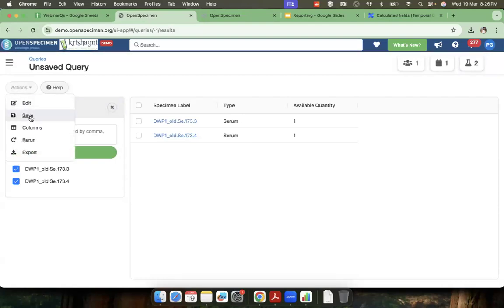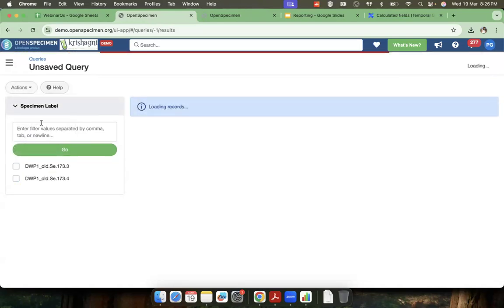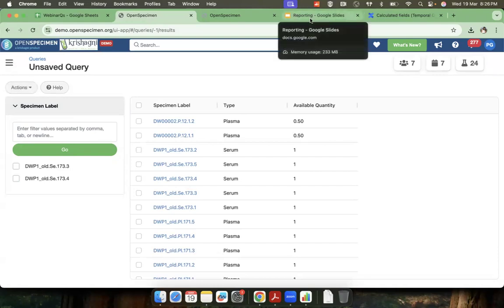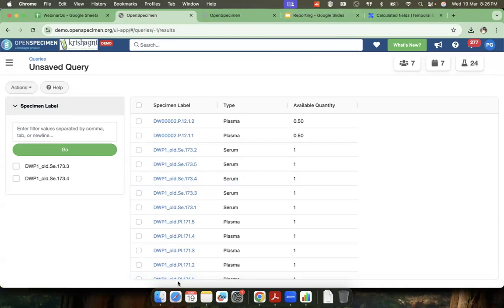And you can save this query now so that you can use it repeatedly. If it is something that you're doing commonly, then you can save this query and use it as well. So these are the things that we wanted to cover today in the webinar. I think I'll stop now and see if there are any new questions.